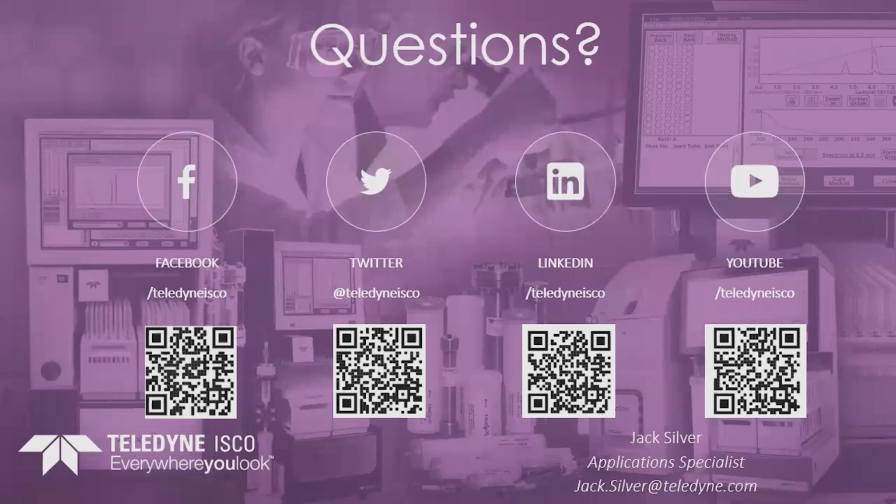Where can you purchase TLC plates to model the amine column? Places I would look for that would be Sigma Aldrich would be one place. CAMAG would be another one. I especially would recommend CAMAG since they do a lot of TLC.